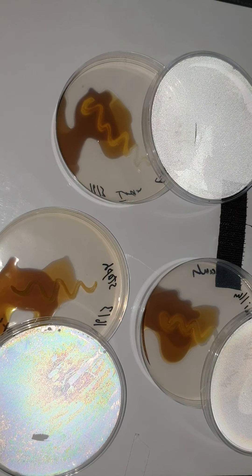If you look here at Bacillus and focus closer on the petri dish, you can see a yellow zone around the colony — it's like somebody has carried a highlighter and highlighted the zone around the colony. This means that Bacillus was capable of hydrolyzing the starch around it. Bacillus is amylase positive.